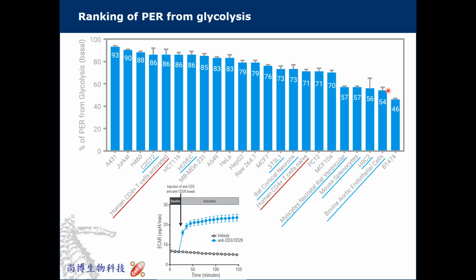So you can see the mitochondrial acidification is almost 50%, almost half. In the white paper, we say that if you don't use the special medium in the normal experiment, and your OCR divided by ECAR is larger than 4, then we suggest you do this glycolytic rate assay to make your glycolysis rate more correct. If you care a lot about glycolysis, we suggest you do it.